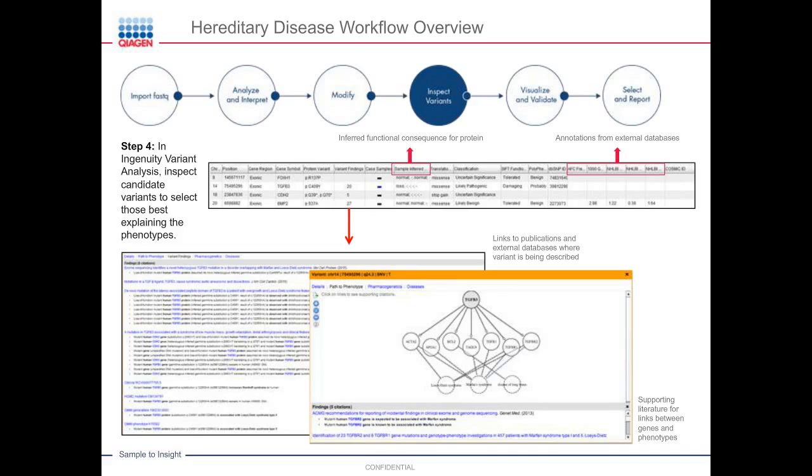Number one is checking back in the sequencing reads, so you can exclude quite a lot of variants which you would otherwise see as candidates. By looking back in the sequencing reads, you can see that these variants are also present in the parents, for example. In the child you can see it, but maybe also in one of the parents or in both of the parents.